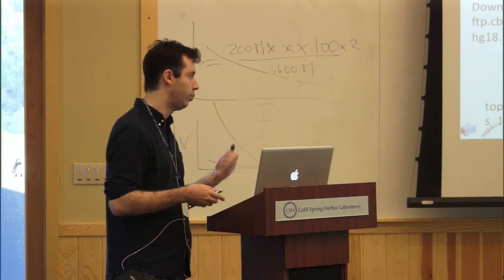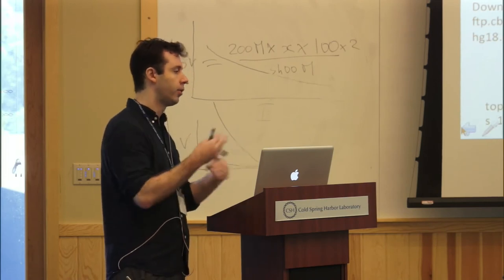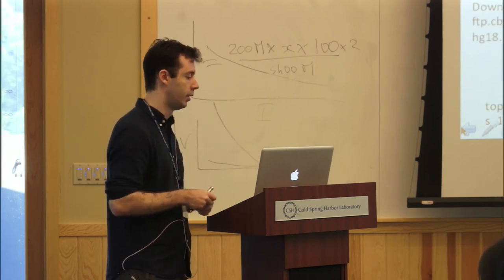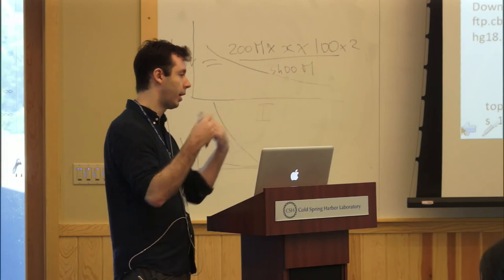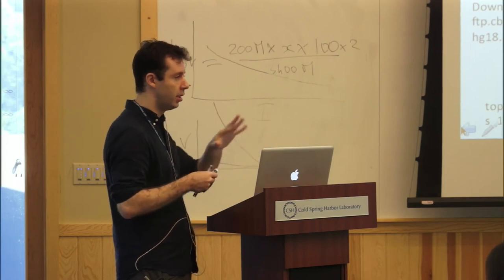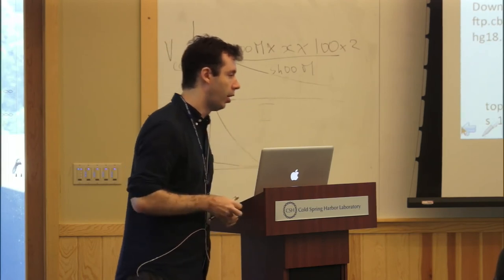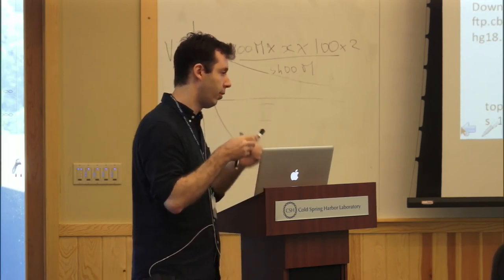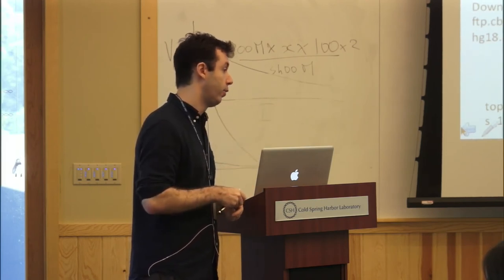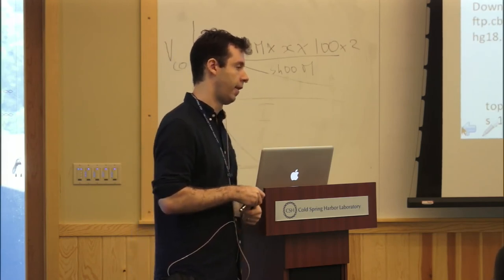We definitely do paired-end sequencing for RNA-seq, and I recommend everybody do paired-end sequencing as well. You might initially look only at the gene expression level, but it's nice to have the possibility to go back to the data at some point and look for isoforms, especially for specific genes. Often I'm not so much interested in a global analysis of isoforms across the genome. You use your gene expression levels as a way to narrow down to a pathway or a couple of genes, and then you can go back to those genes and do a very careful analysis of splicing. I think that's where paired-end RNA-seq is really useful.